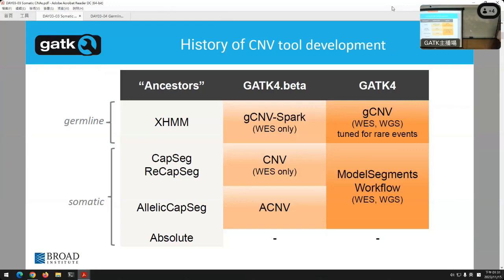We've been working on copy number variance, not just on the GATK side, but in many, many teams, with many tools, for a long time. And it's been hard. It's actually taken a while for us to do well. Early on in the days of SNPs and indels, we got success quickly. It took a lot more with copy number. And that's because you have very short reads, and there are so many inconsistencies and so much noise. We were just making a lot of mistakes.